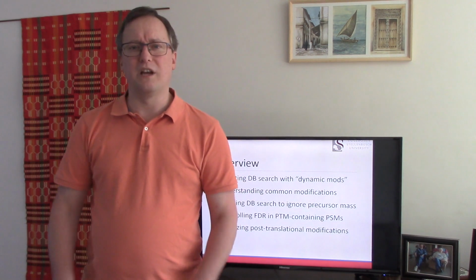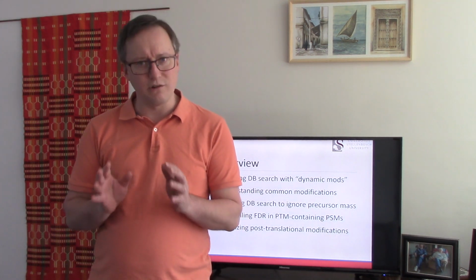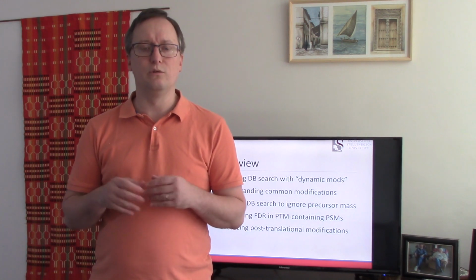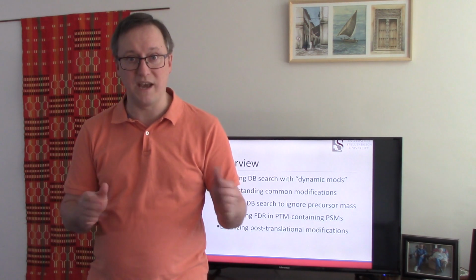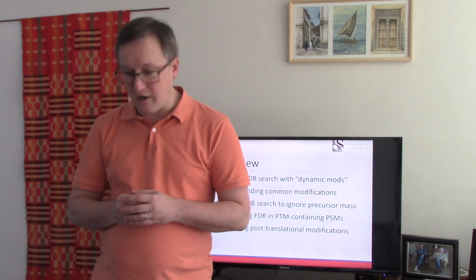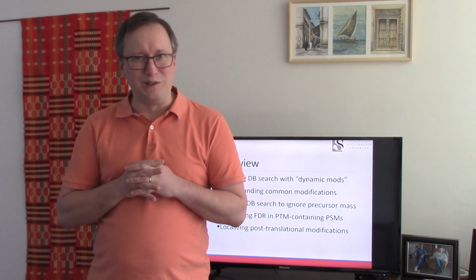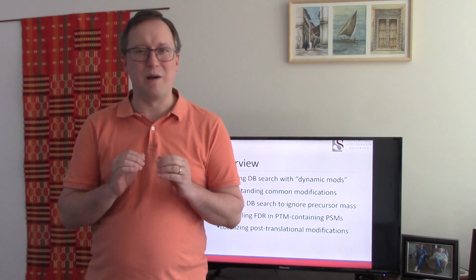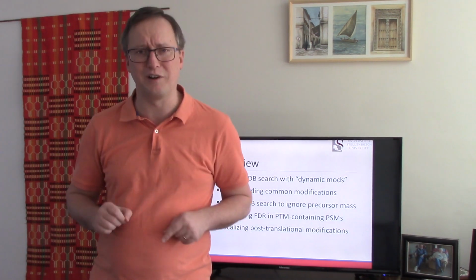We're going to start with kind of an oldie but a goodie, the approach that allowed us to adapt standard database search engines to look for variants of amino acids, not just the amino acid masses themselves. From there, we will talk about kind of a villain's gallery to look at all the different mass shifts that seem to crop up in lots and lots of data sets.